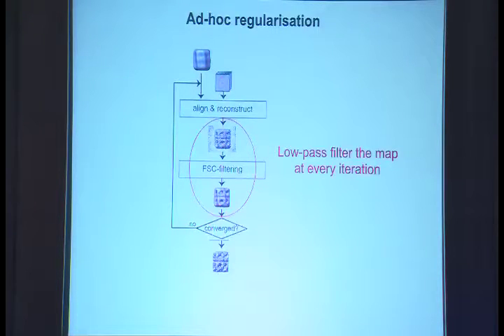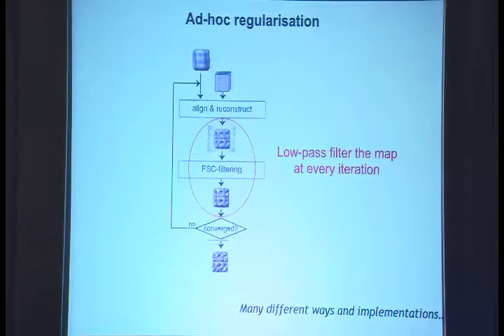So this can be implemented in different ways. And previously, in the past 10 years, this has been done kind of by trial and error. So it's left to the users to determine how you low pass filter or how you apply the filter, which results in the user determining it, which is a very bad thing, because if you don't know exactly how this works, then it's possible that you get something which is not true.